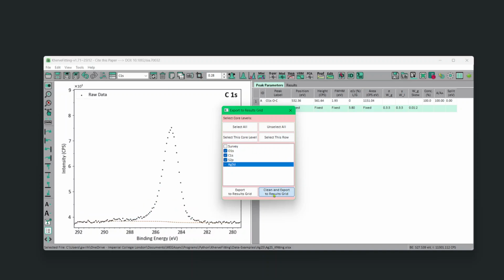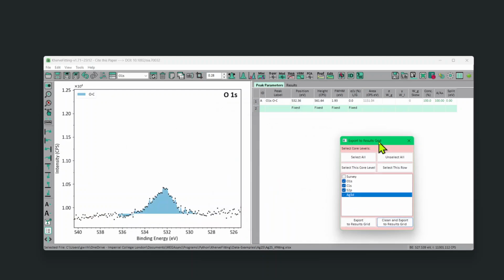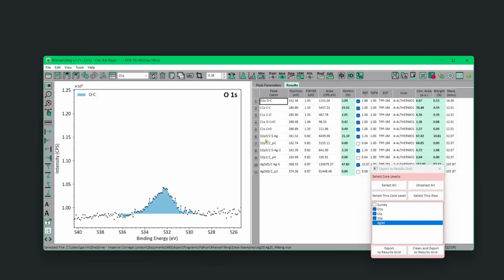And we export that, and what you get is something with the carbon 1s, and something with sulfur and something with silver. So all you have to know is sometimes the 1/2 is still ticked, so you can untick this, making sure that the 1/2 is not ticked is the same as that. So you can see that this is 16.7, almost the same number.